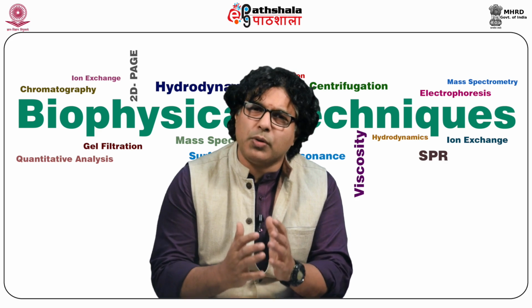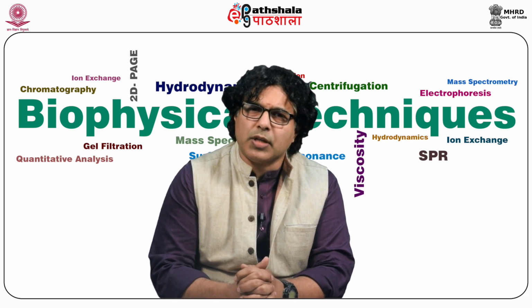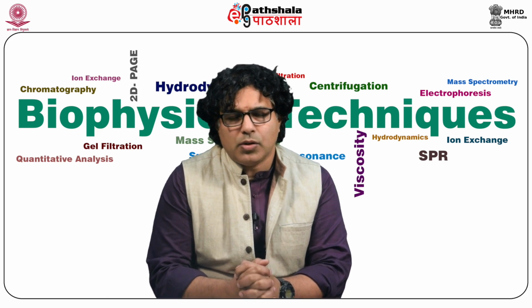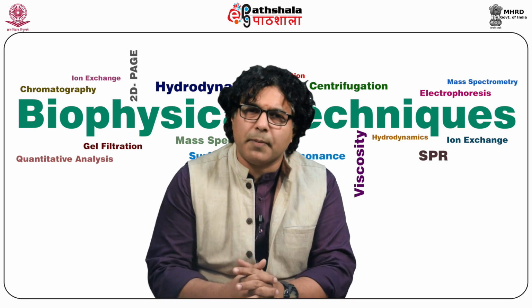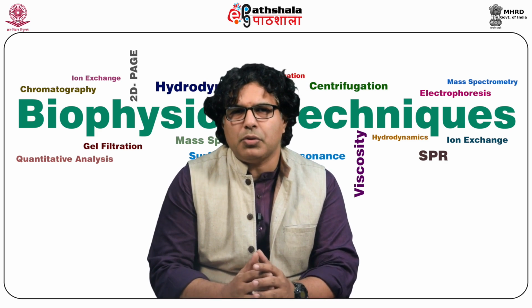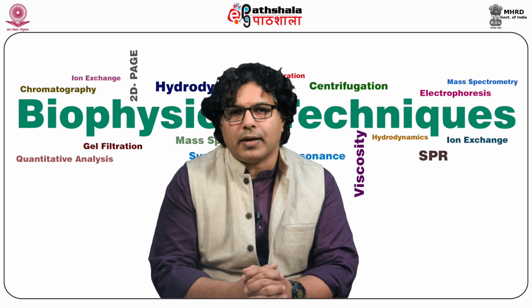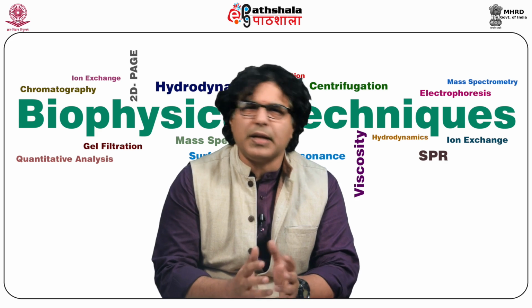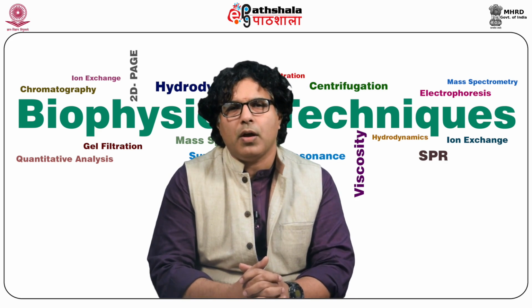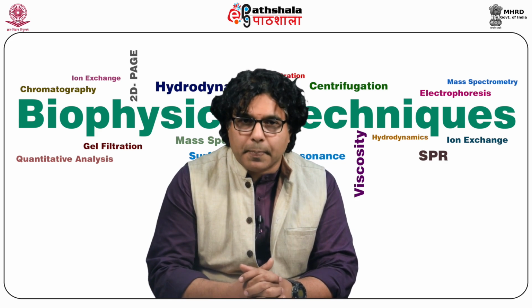So how to purify your analyte to some extent from this matrix, these interfering matrix elements? In this task we use different methods to some extent to remove the interfering matrix, so that we can get a relatively good amount of a good type of sample for further separation in the HPLC.